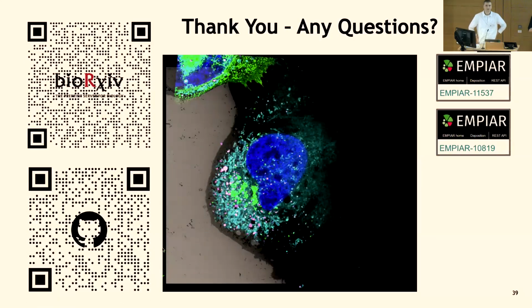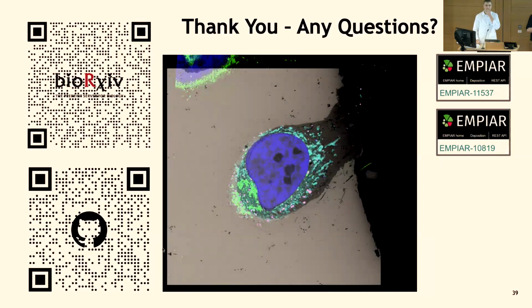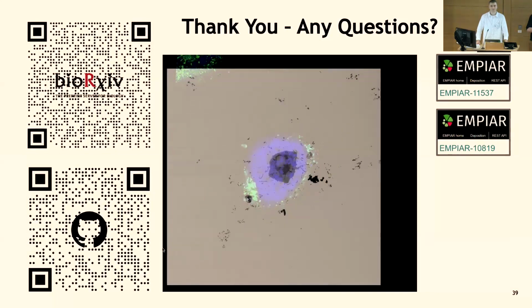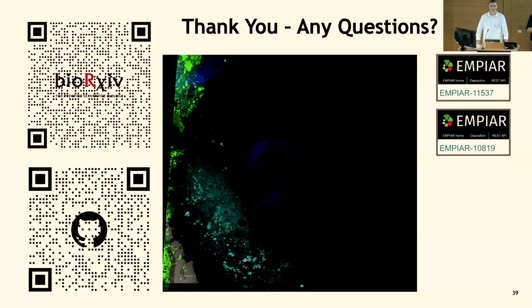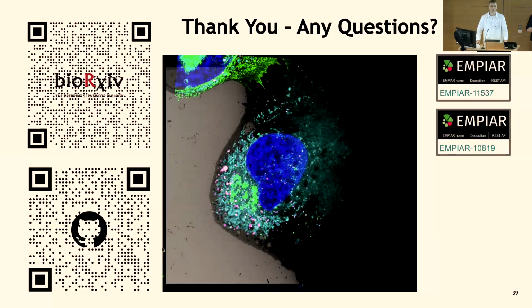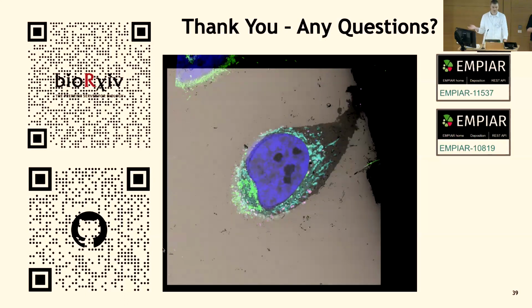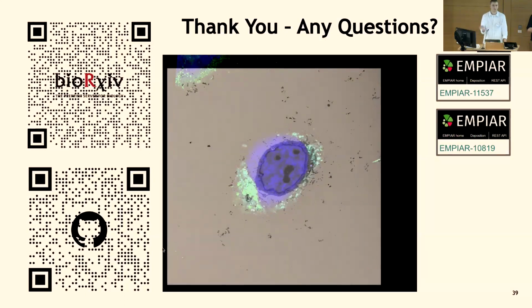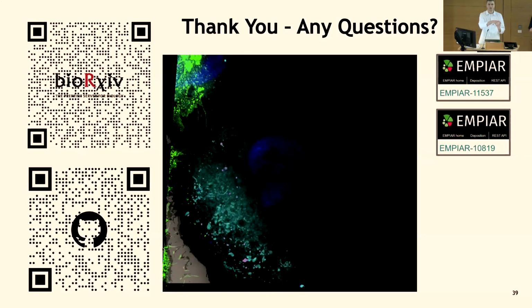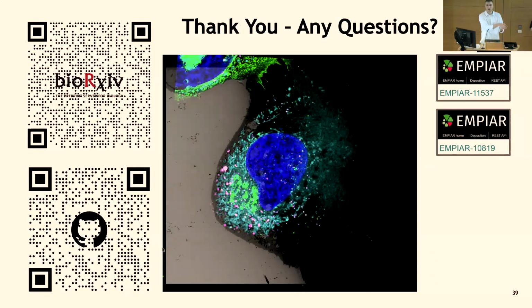So I suppose you could rotate your alignments and see how likely it is just by randomly hitting something. You could then have a baseline, because if you've got a cell absolutely jam-packed full of mitochondria, then your likelihood of hitting mitochondria just by random might be quite high. We wouldn't measure the mitochondria because that's the target organelle. That's why we just selected non-landmark organelles, because, for example, lysosomes may be a little bit more sparse. We would use that as a metric, but for mitochondria, like you said, it's so abundant. We don't use it to quantify the alignment, just to actually create the alignment in the first place.